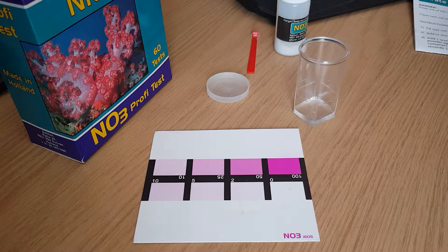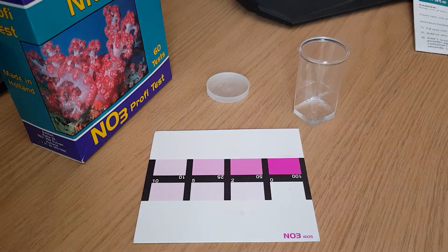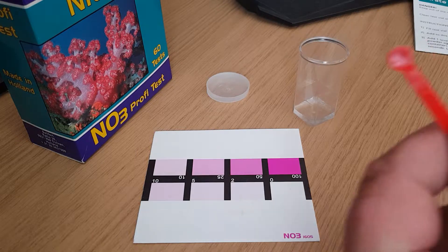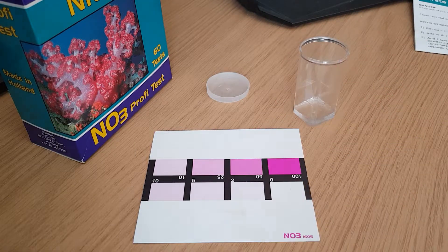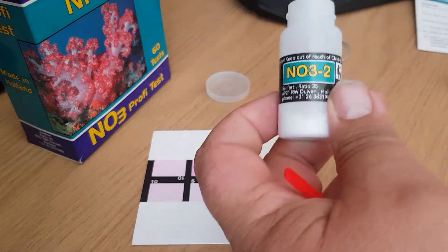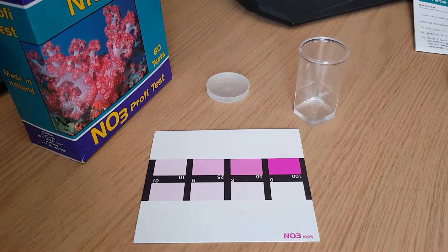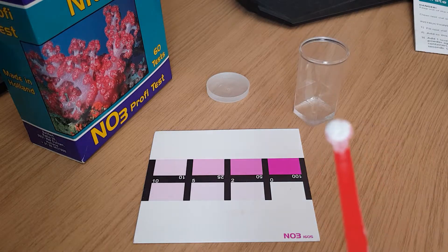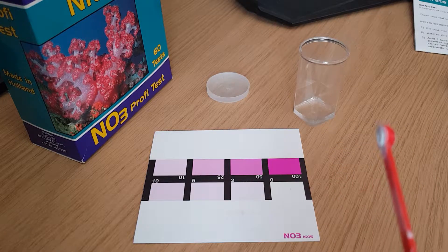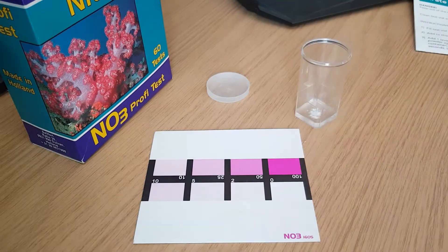Then it calls for one level scoop of powder, which is NO3-2. The level scoop is this little scoop thing, and the NO3-2 powder is in this little top here. It says to crush it into the side of the bottle so you get a nice flat level — tap that in there and make sure you get it all.